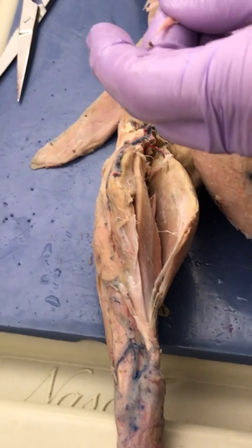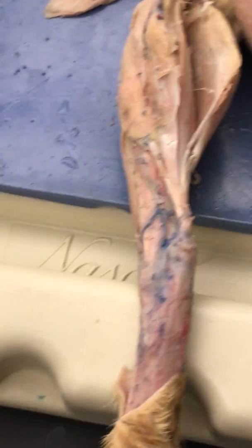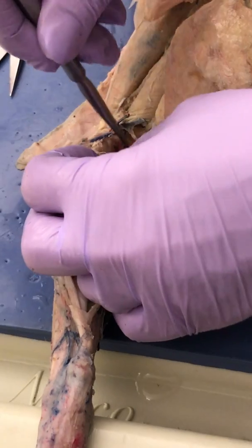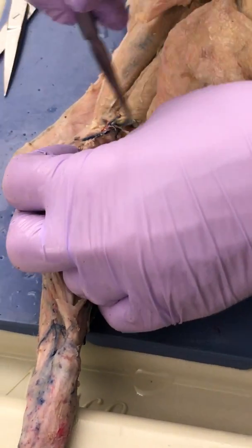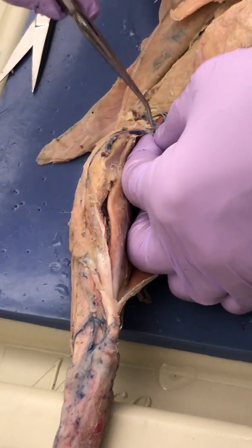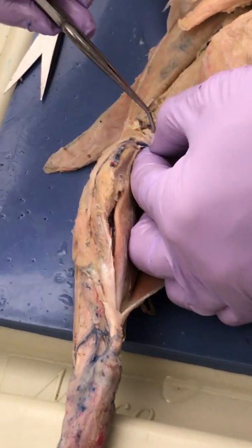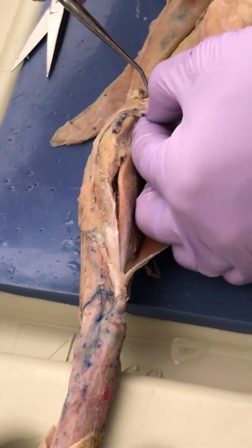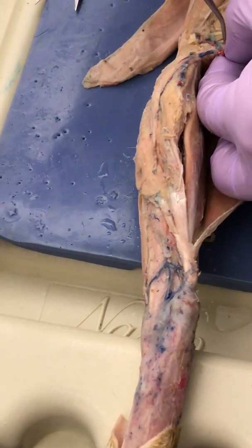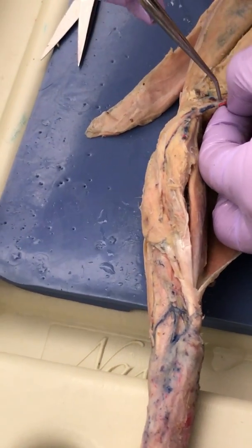What's the name of that nerve? The sciatic nerve. You guys are killing me. I teach you more stuff and you delete what we already had. Can't do that. We're trying to keep space for the arteries. You made space for the artery. That's like you asked me where the bones are. I'm like, dude, be there. Don't tell her that. You know how you have to create space.